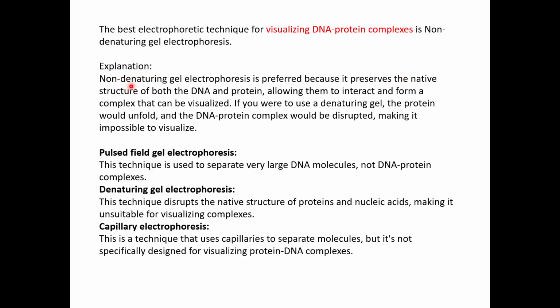You do not have any sort of heat treatment. You do not have your detergent, so the protein is in its native form. So the native structure of both your DNA and your protein is present, allowing them to interact and form a complex that can be visualized.